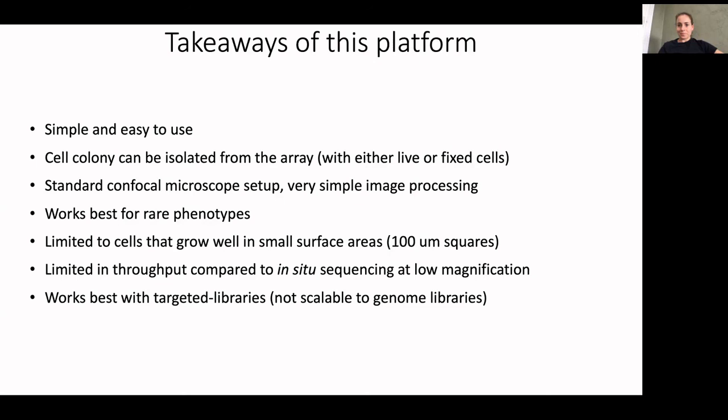transducing each colony? Yeah, so I think that to your second point, if we wanted to test these multiplicity things, what I would recommend doing is using the CRISPR vectors that allow you to specifically design and express more than one guide RNA on the vector itself, so that you can very nicely control for that and design it in a way that you can recover rationally a combinatorial design. In terms of whether a single RNA binding protein can strongly reduce these granules, the fact that the granules themselves have like hundreds of proteins inside of them, I guess it's not that surprising that depletion of a single one would not really ablate them completely.